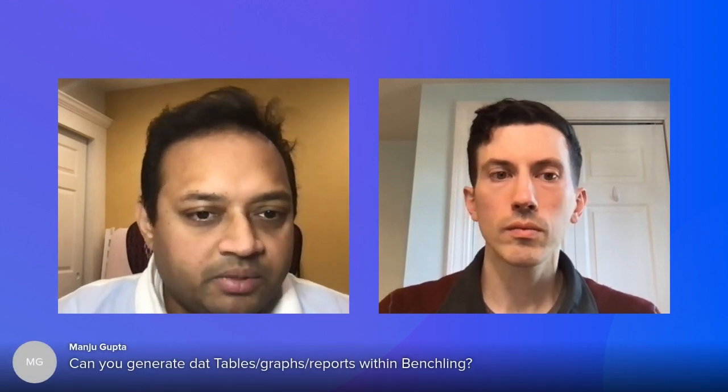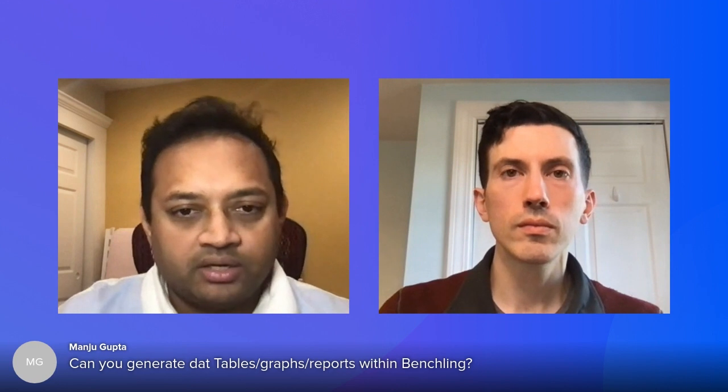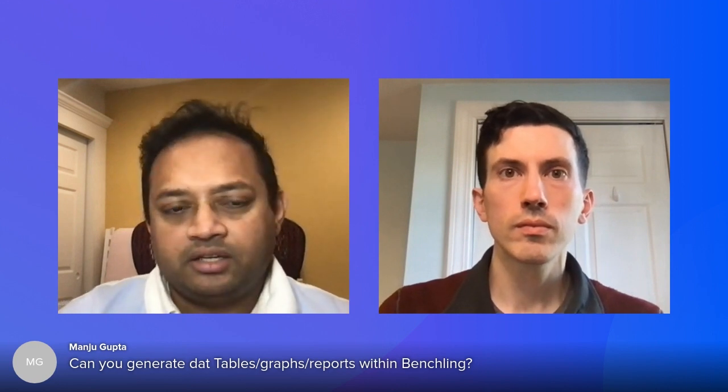The next question reads: can you generate data tables, graphs, reports within Benchling? I think I can comment briefly, and then you can add to that, Tom. So I think there are two ways, right?